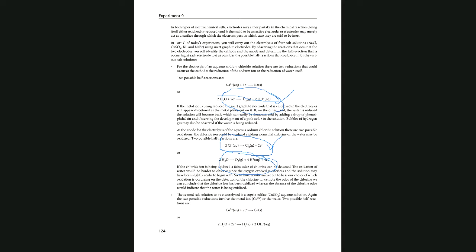And this reaction, the top reaction for Cl minus giving Cl2, as the oxidation half in the anode side. And then your observation is going to be recorded when I perform the experiment. So you're going to record the observation as I perform the experiment.